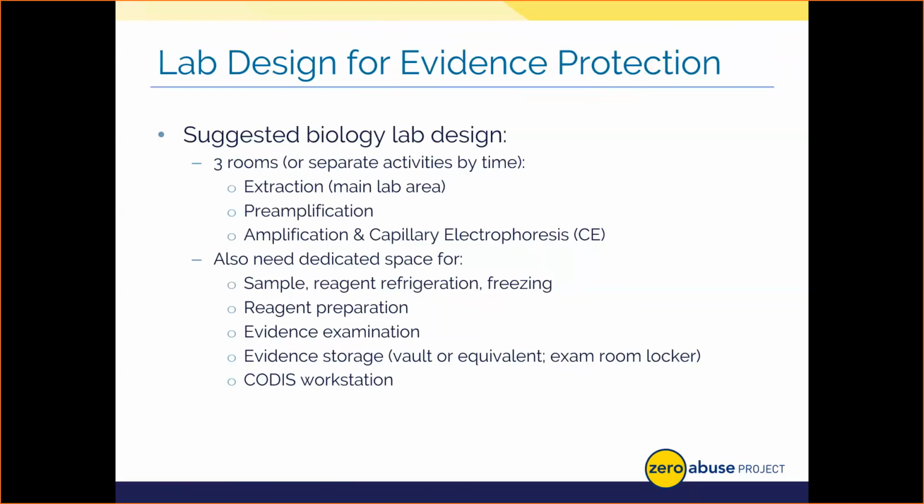Now, typically some other things that you might see is dedicated space. We had all of our fridges and our freezers locked behind doors, and then they actually had locks on them themselves to minimize access and ensure chain of custody wasn't compromised. Little things like this, right? Having a separated CODIS workstation for your Combined DNA Index System. Having separated vaults. We had a vault that was away from where the lab was processing evidence. All of these things are great for protecting your evidence and ensuring quality processing.